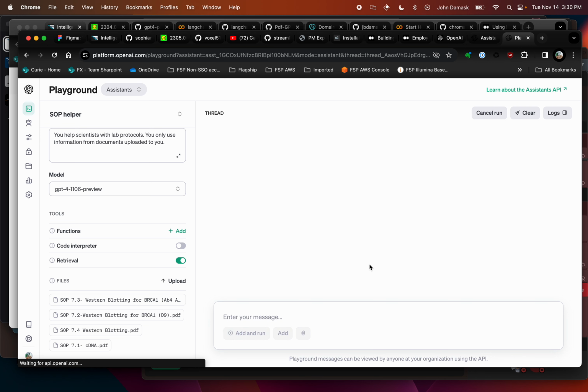And let's see. So this might take a minute because I think it's chunking the data in the background here. And we see down here, this is spinning and spinning and spinning. So it streams information back to me, so it's not computing everything in the background and I don't have to wait for everything. So we should see it start to output some data soon.